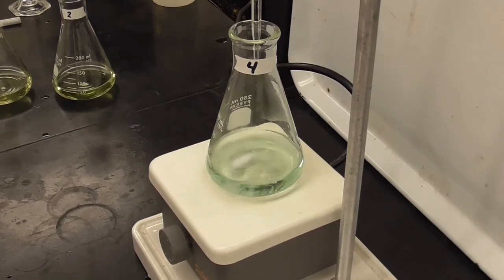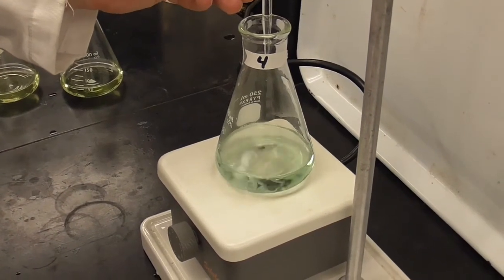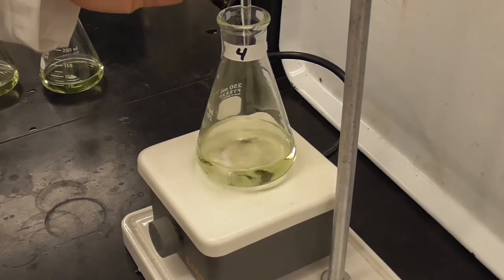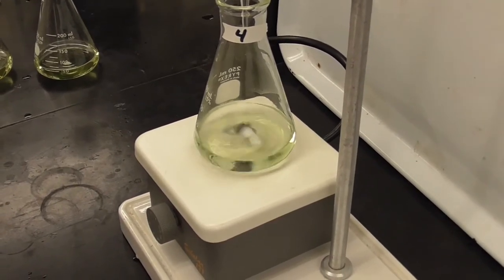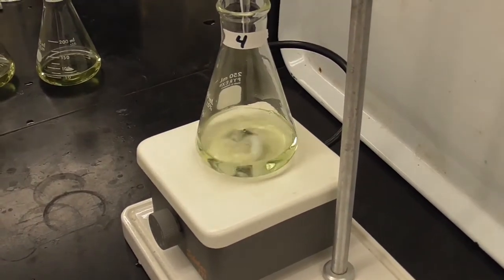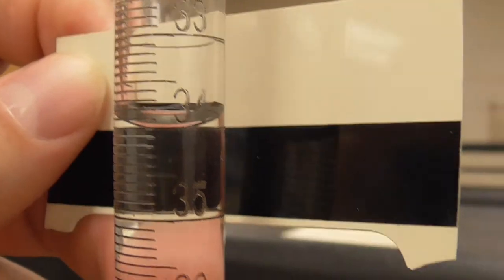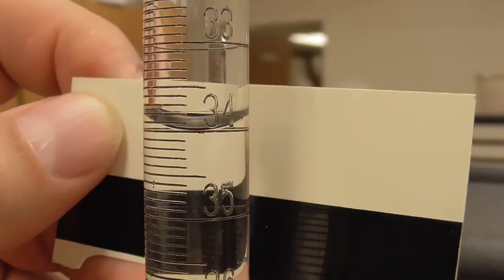Okay, here is sample 4. We didn't come quite in. It's already green, so we're probably within a drop or two. Let's try, stop. And I think maybe just 1 drop. There we go. Okay. Let's see here. Okay, you can see the number up above there is 33. Now drop, yeah, there we go. Okay, so there's the ending point for sample 4.